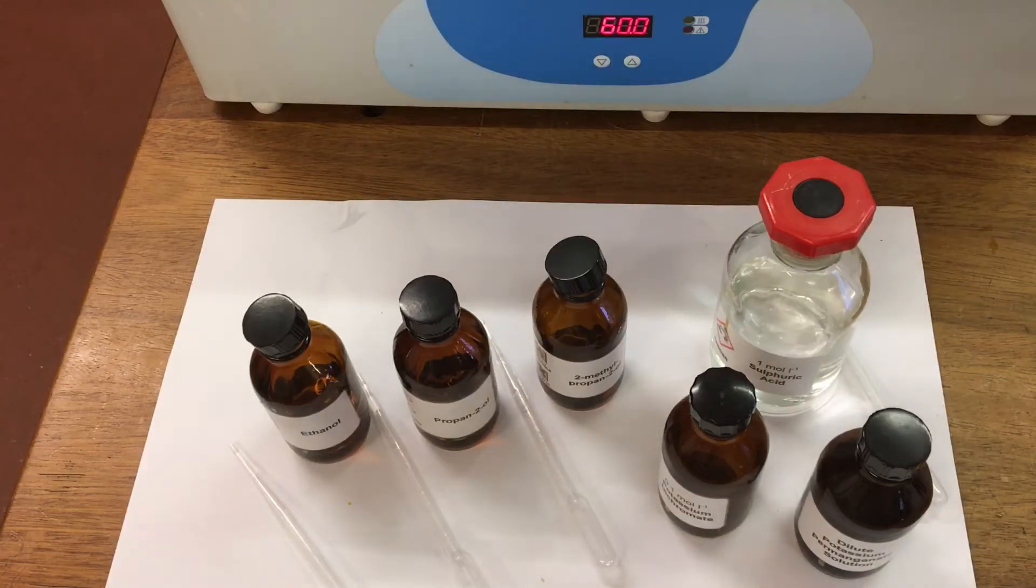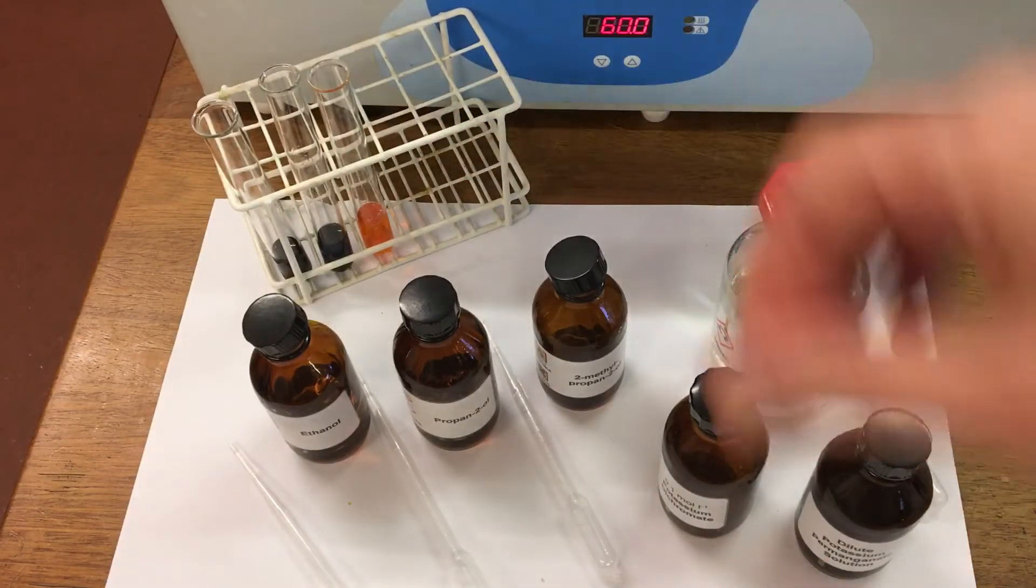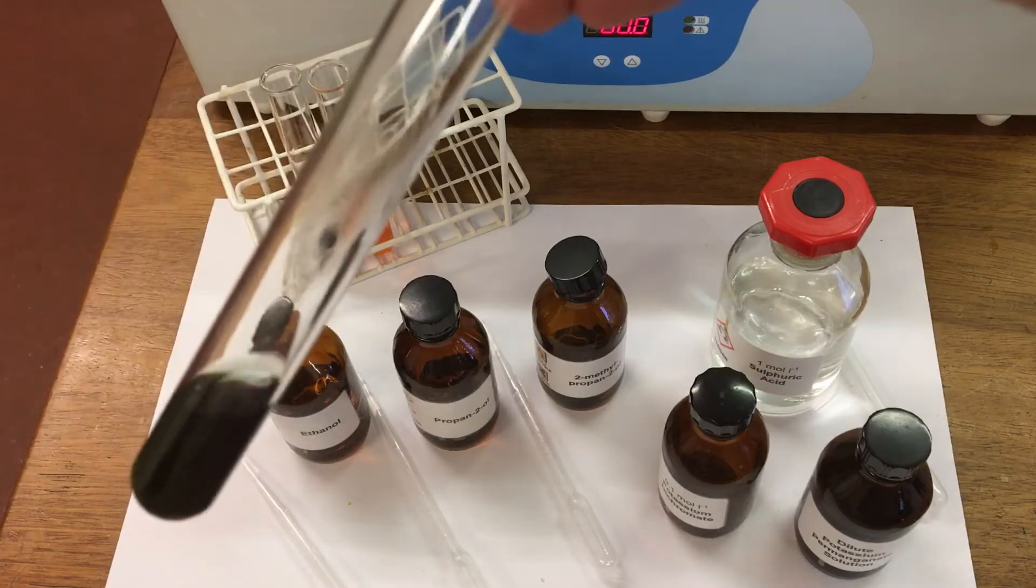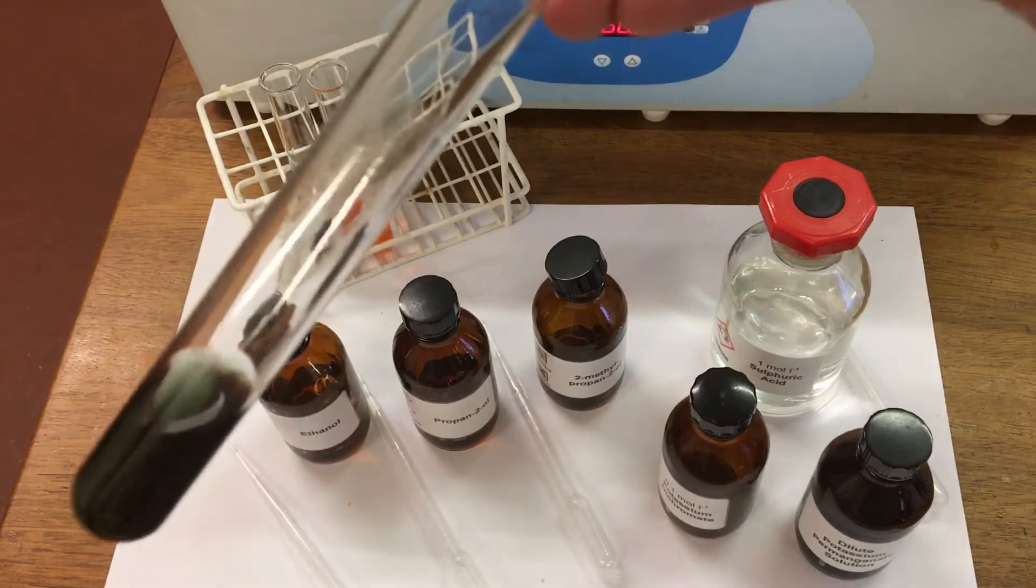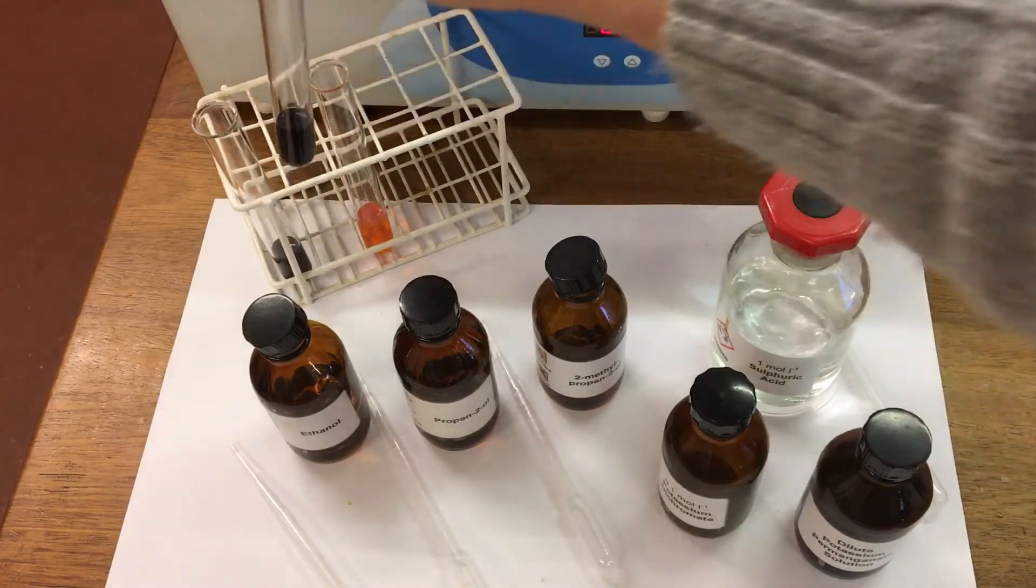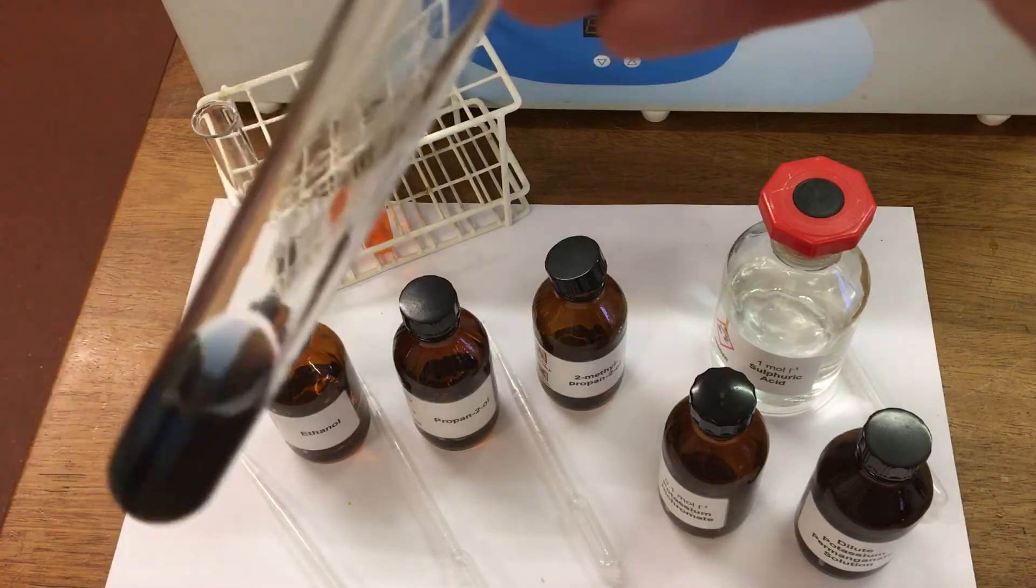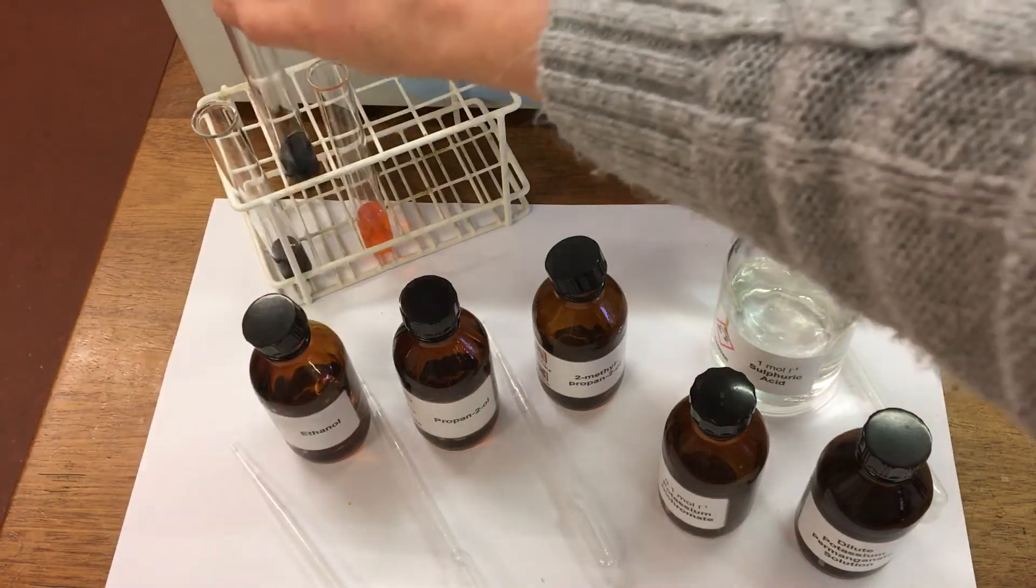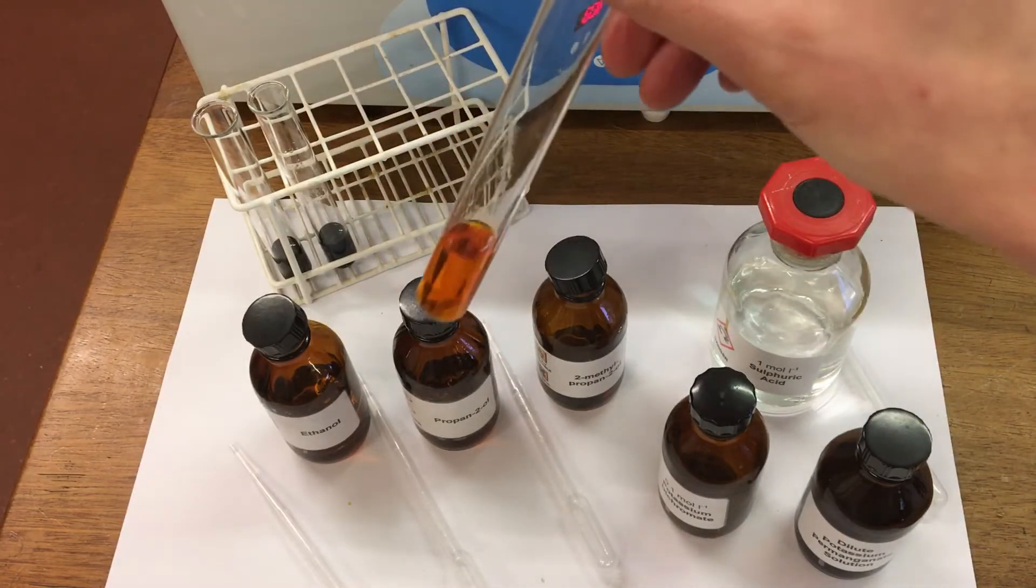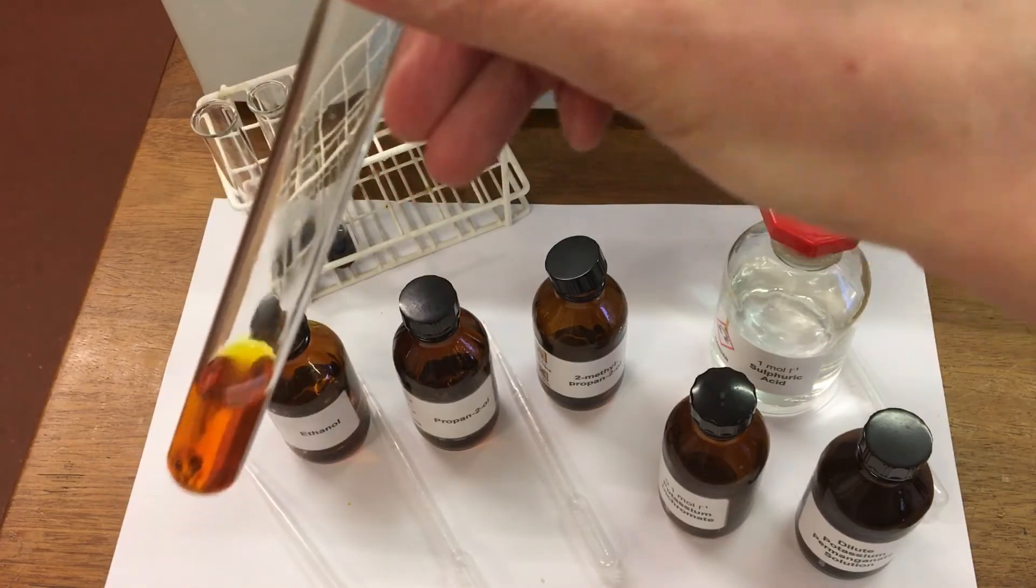And then after a couple of minutes, we can look at our results. So for ethanol, we've got a blue-black color, greeny-blue, so that one has oxidized. For propan-2-ol, again we've got a blue-black color, so that one's also oxidized. And for 2-methylpropan-2-ol, there's no color change there, it's the same color, so no oxidation.